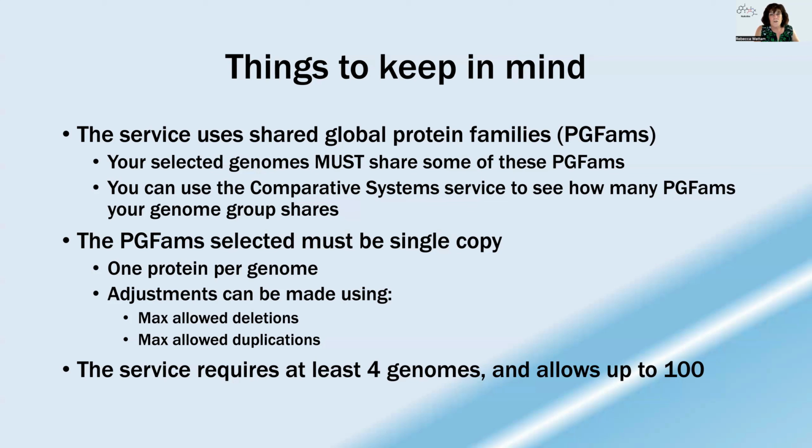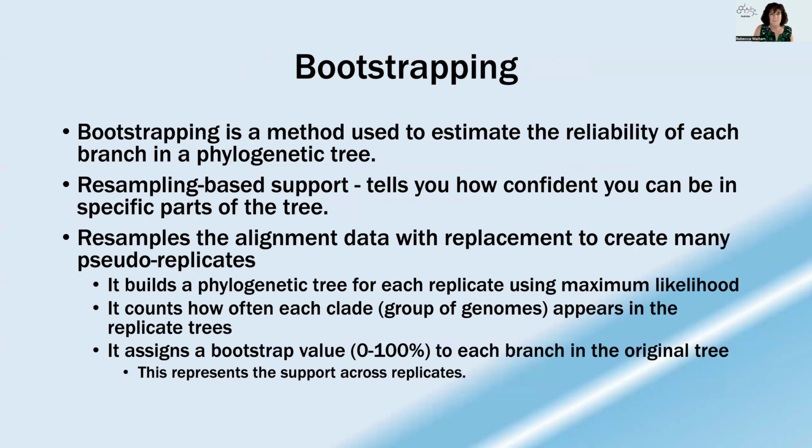Why one wants a tree with just 3 genomes is beyond me, but sometimes we do. You're going to have to generate that someplace else. You can't do that here. Add one more. Genomes love company.